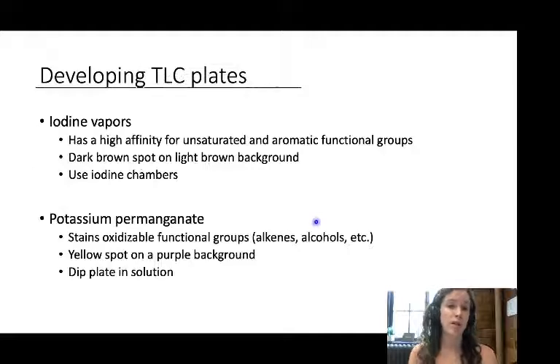We're going to be doing some additional fun development of TLC plates. First off, yes, when those TLC plates are done running, check them under the UV lamp. But this week we will run 2 plates to do additional development steps. I know I mentioned this last week, but we ran out of time.